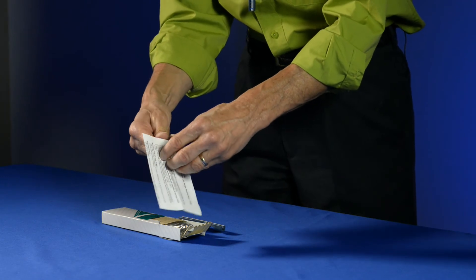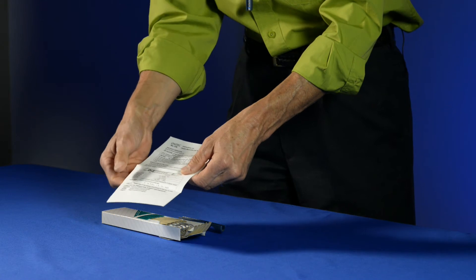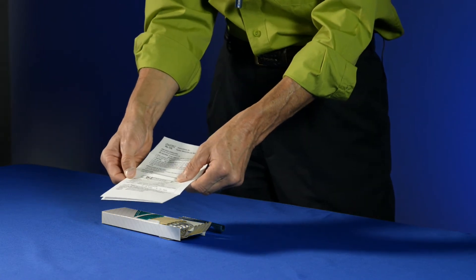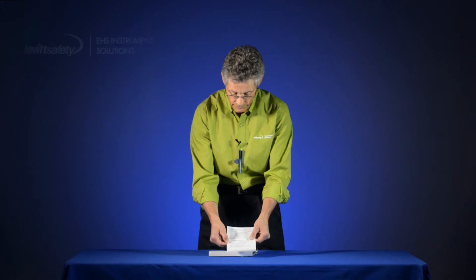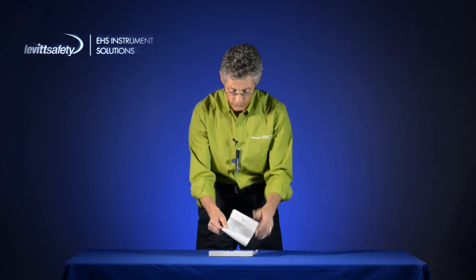And the other is the instruction card. And the instruction card is very important to read because it tells you all about the detector tube, the range that you can use it in, the sampling hours, the detection limit, any cross interferences, any effects of humidity or temperature. So it's well worth your time to read that and understand what the tube can do prior to using it.